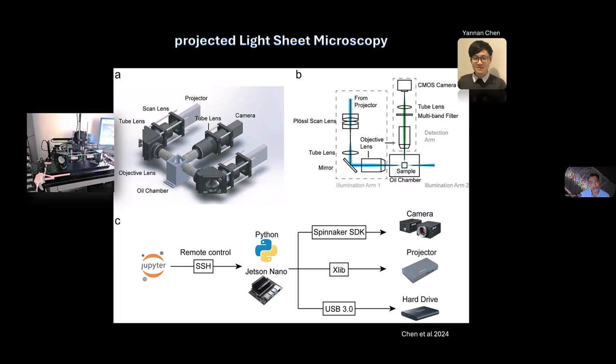We found that we could use cheap $300 pocket laser projectors to generate high quality, powerful, thin sheets of light that we can use for 3D imaging in a light sheet microscopy format. In this work, we also used a consumer-grade CMOS chip that is much less expensive and still provides good enough performance.